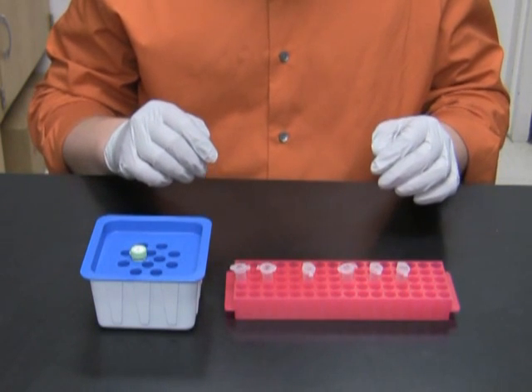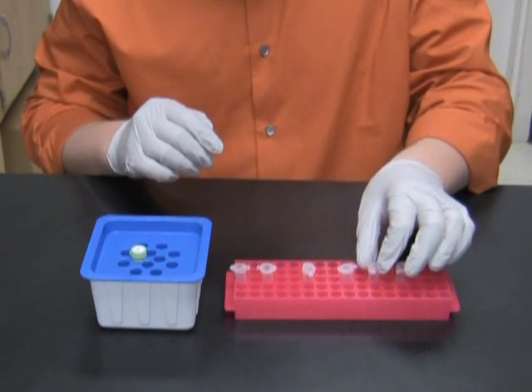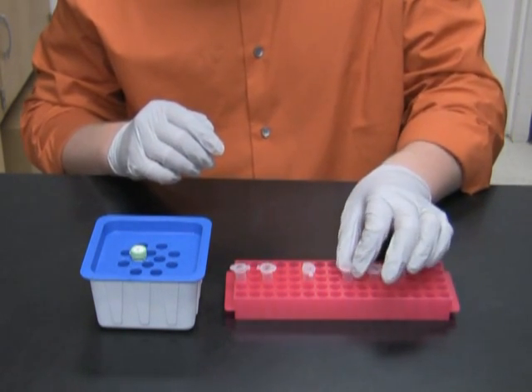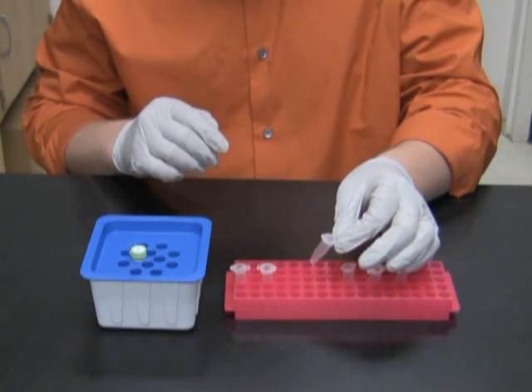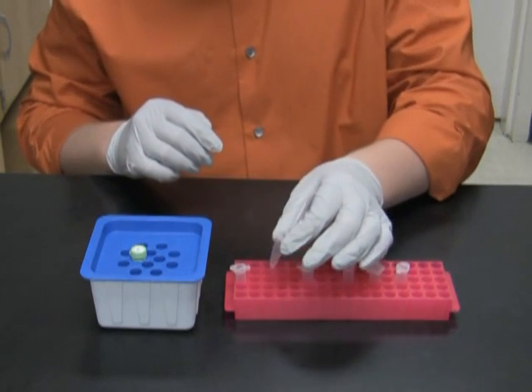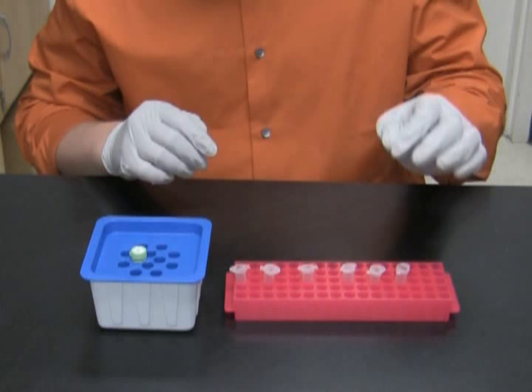Let's set up the ligation reaction. Here on the bench I have double distilled water, a tube with cut vector, a tube with cut insert, an aliquot of ligase buffer—remember that ligase buffer has to be aliquoted to avoid freeze thawing—an empty tube for vector plus insert, an empty tube for control, and the T4 DNA ligase.